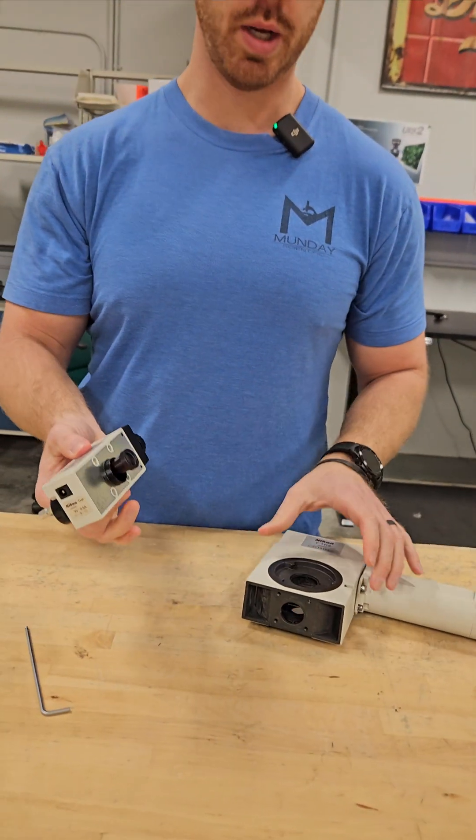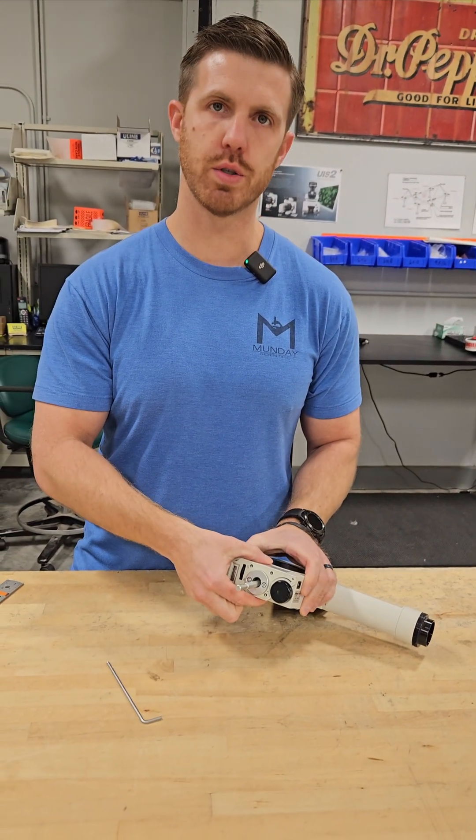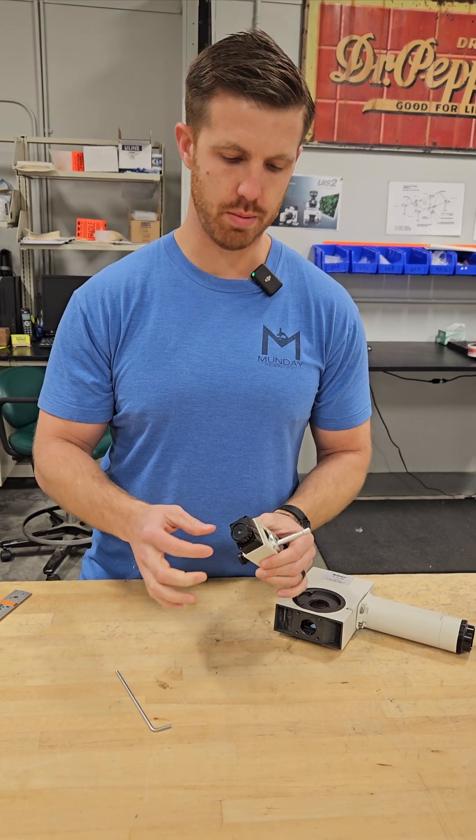There's the pointer assembly. To put it in your other one, you would just slide it in the hole there and tighten the four screws and you're good to go.